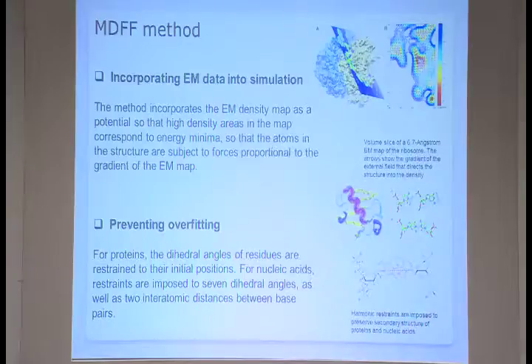So all these things you keep. Then you have to add hydrogen, everything. After that you put this constraint. So you put hydrogen also, you have to assign the potential, because you have this potential function first, where you put all the atoms' potential.